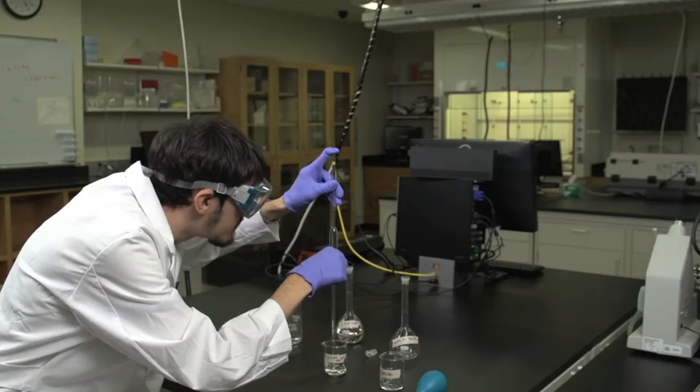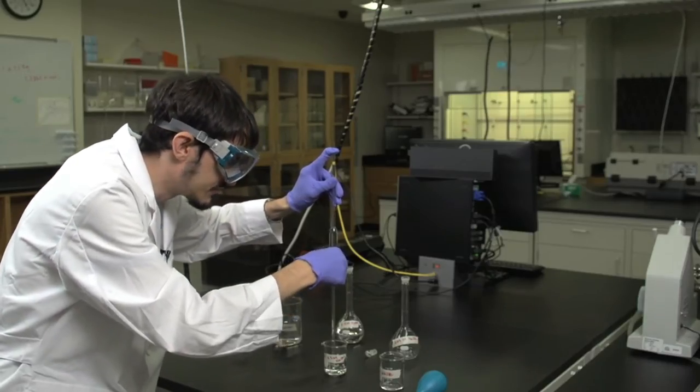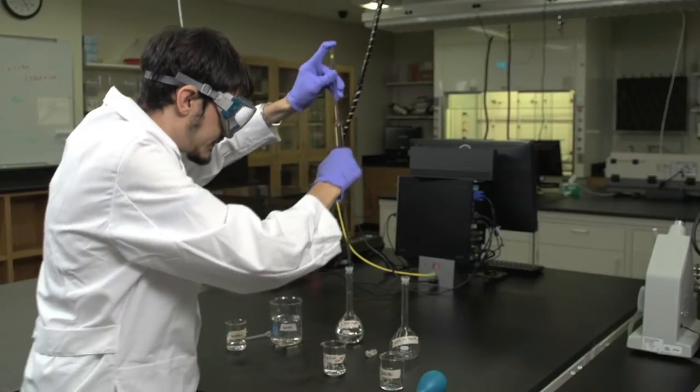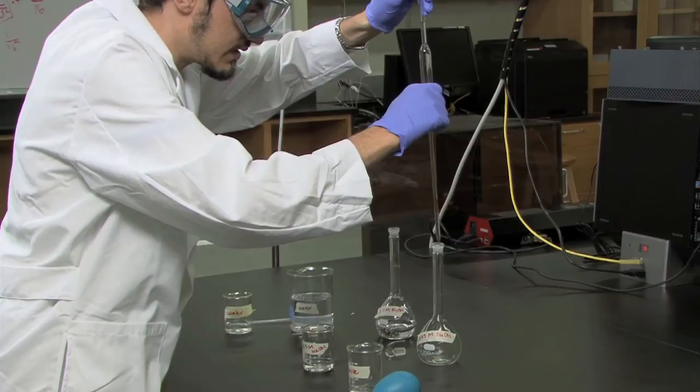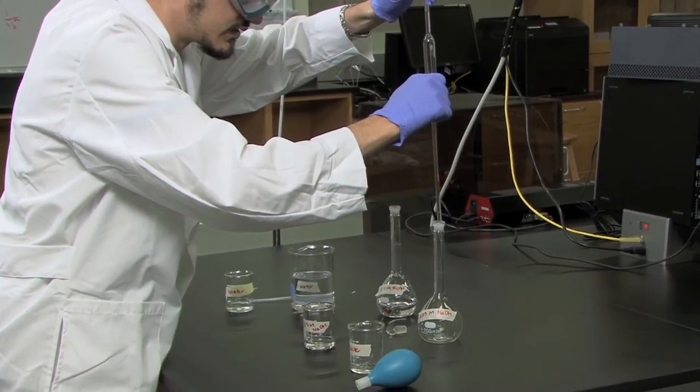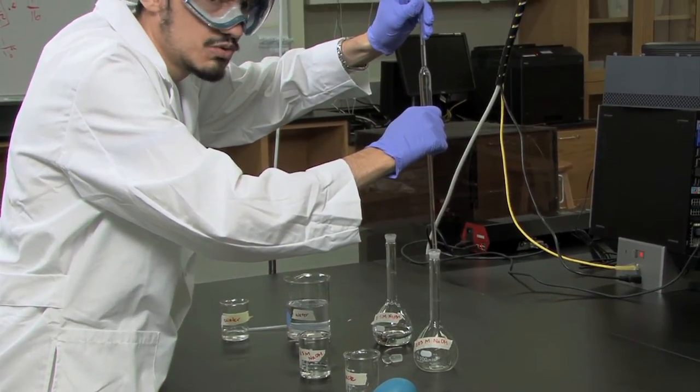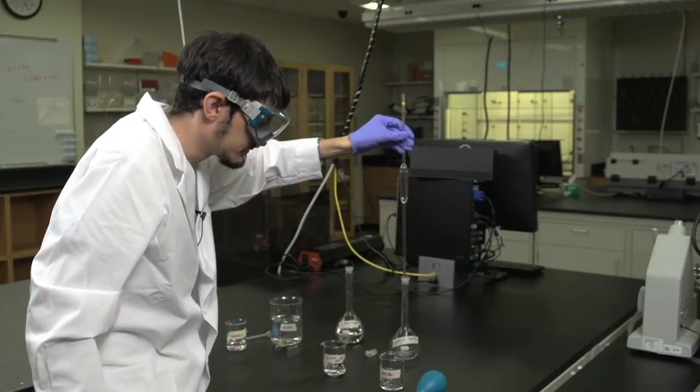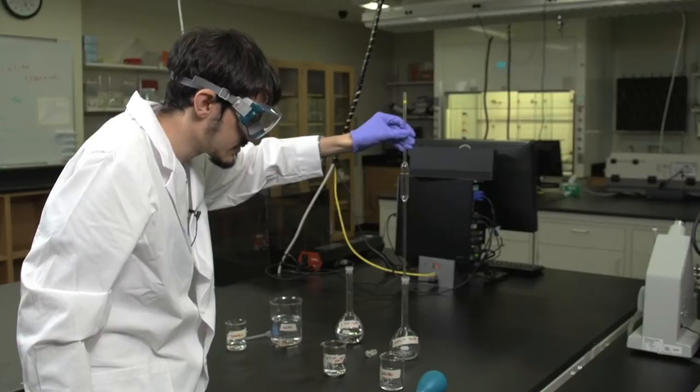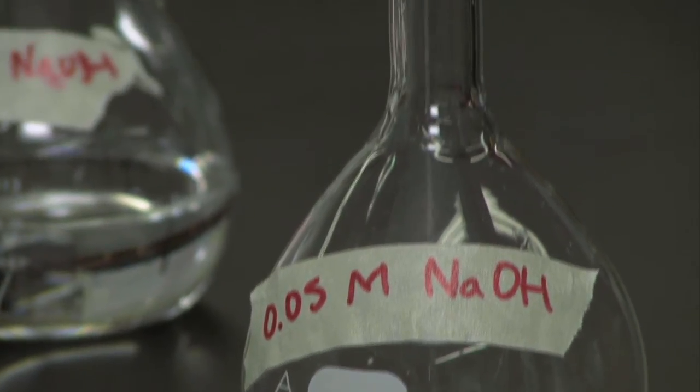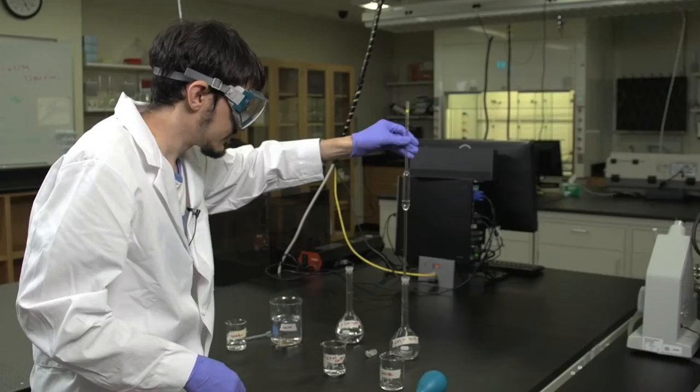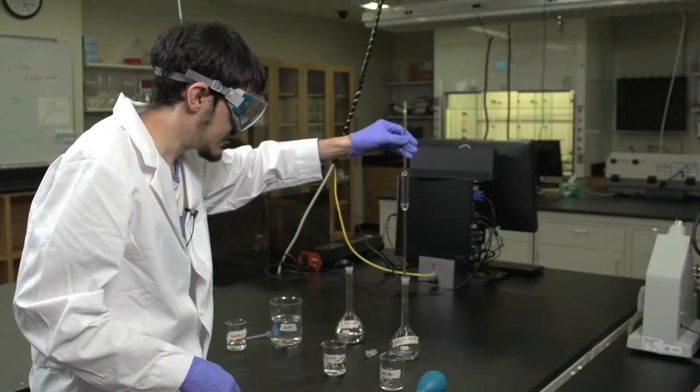Once you are at that point, place your finger firmly above it so that the solution does not fall anymore, and carefully take the pipette, placing it over the volumetric flask in which you will make the solution, and release. It's important to remember not to blow out the remainder in this step.